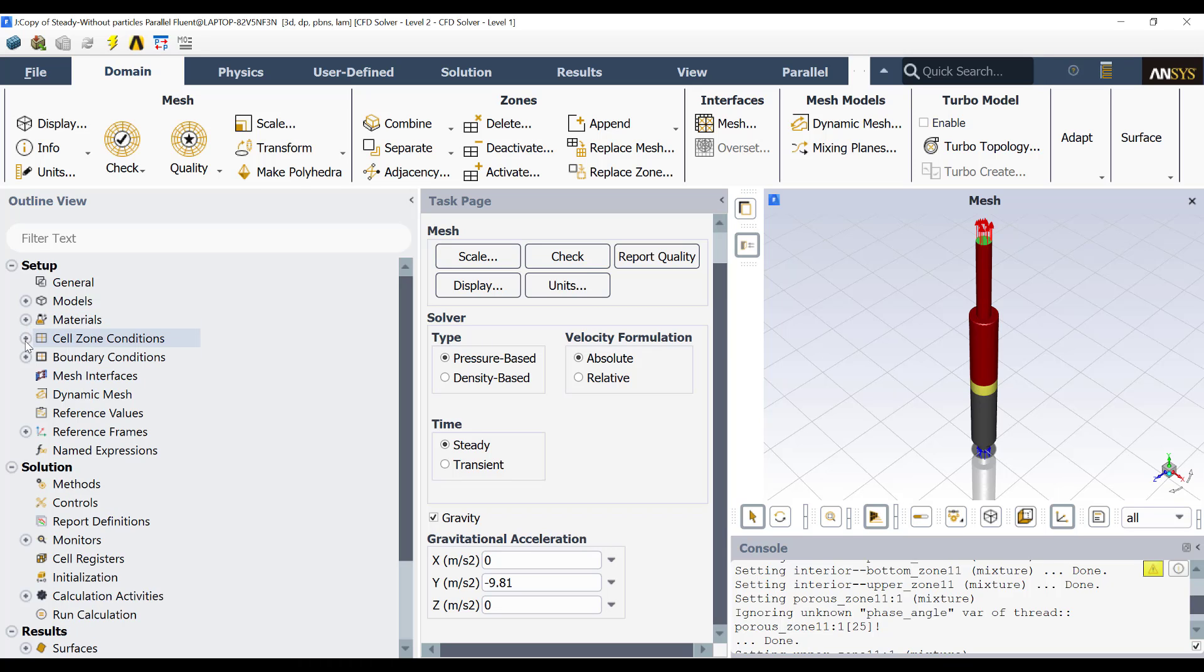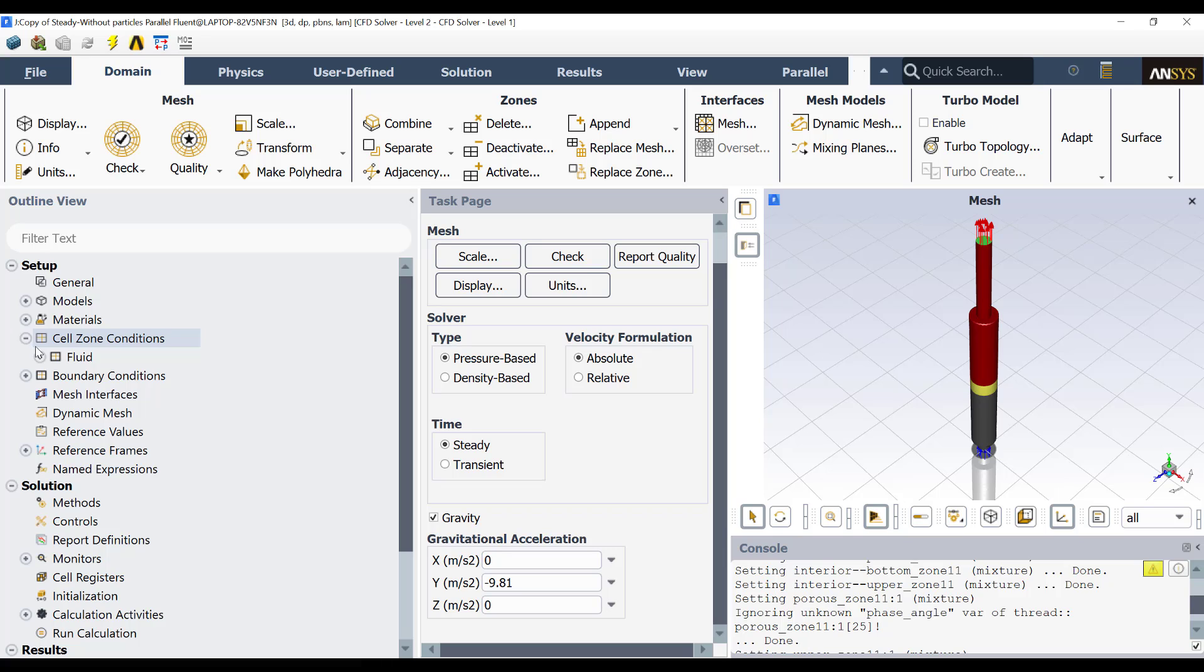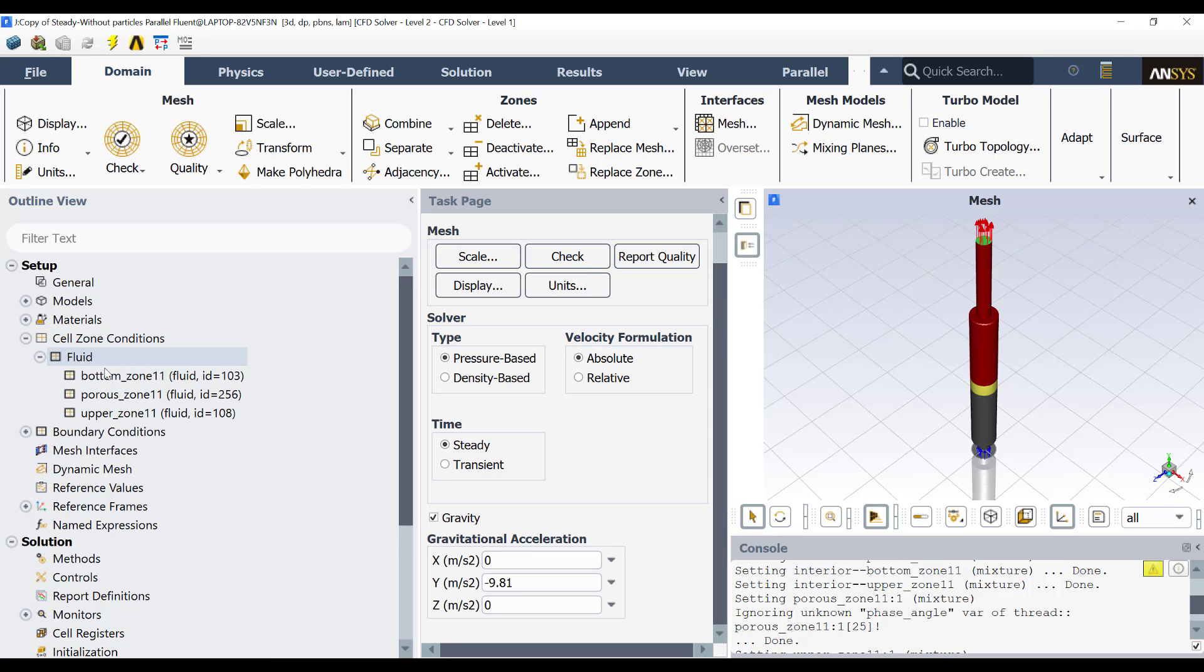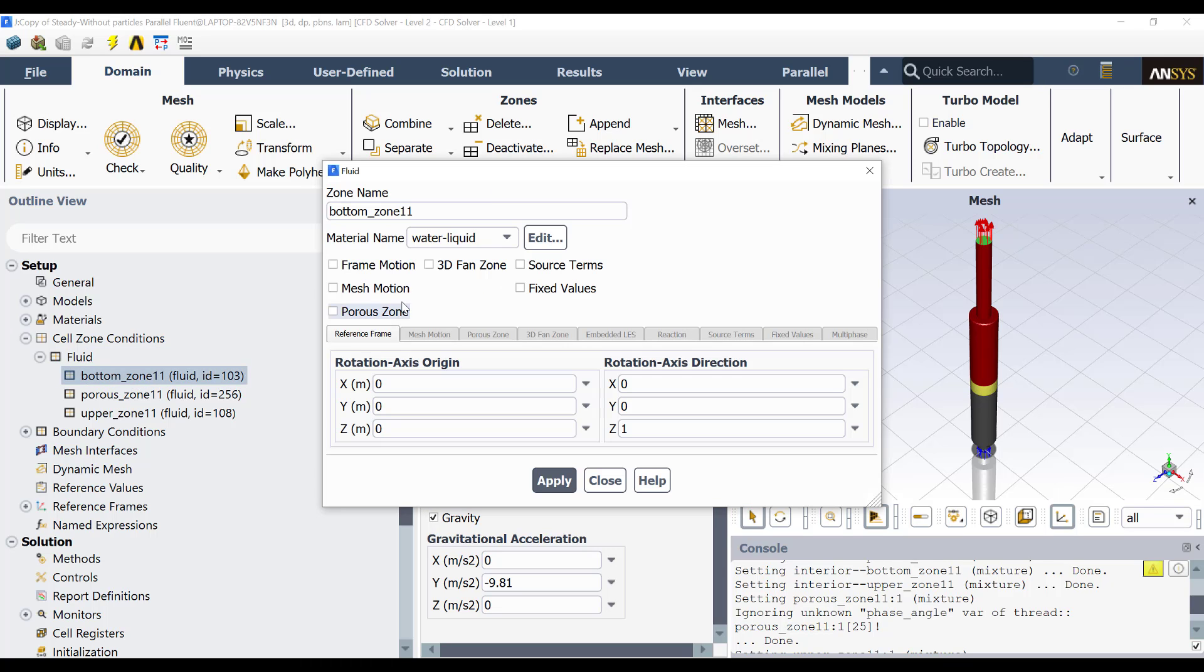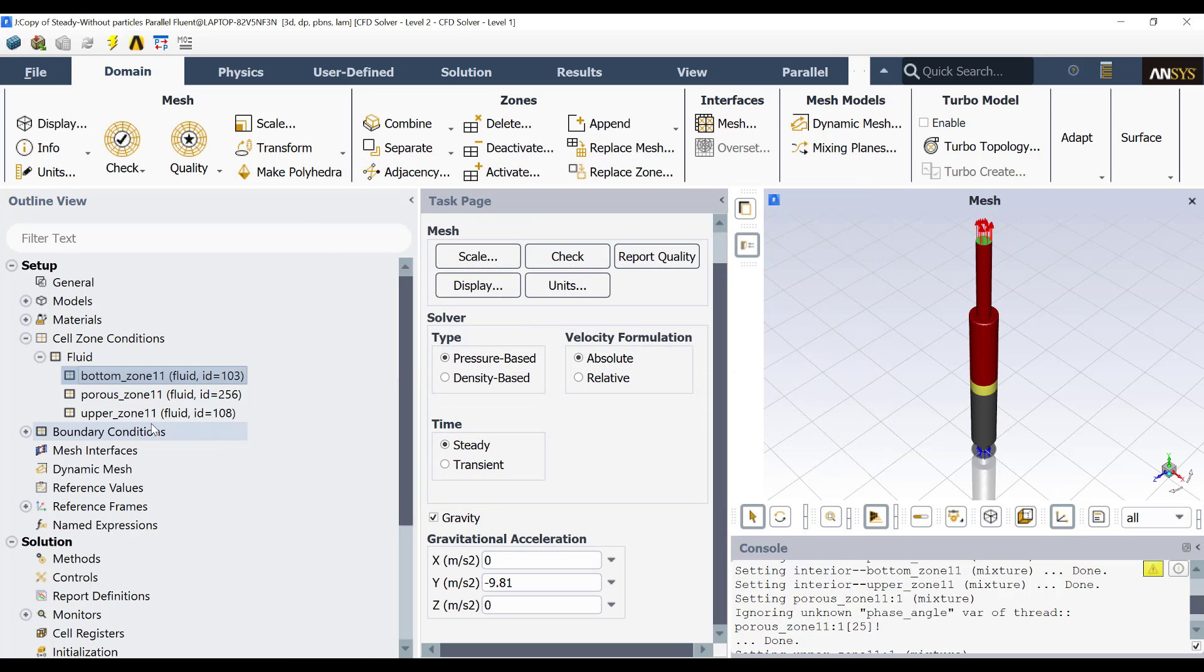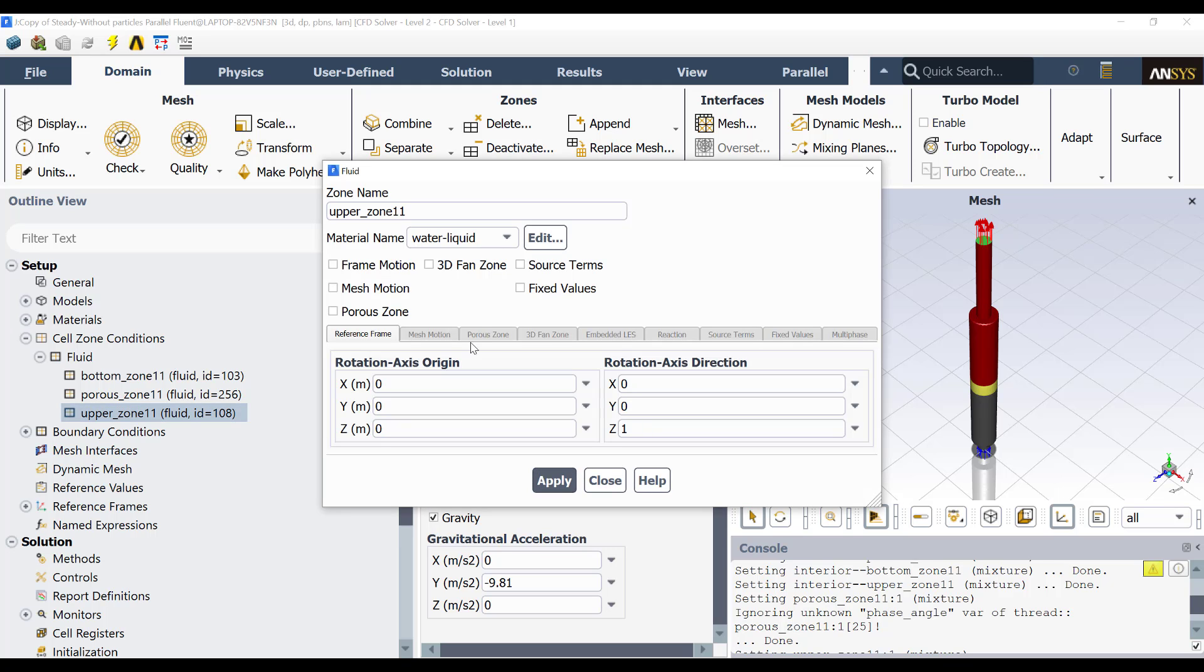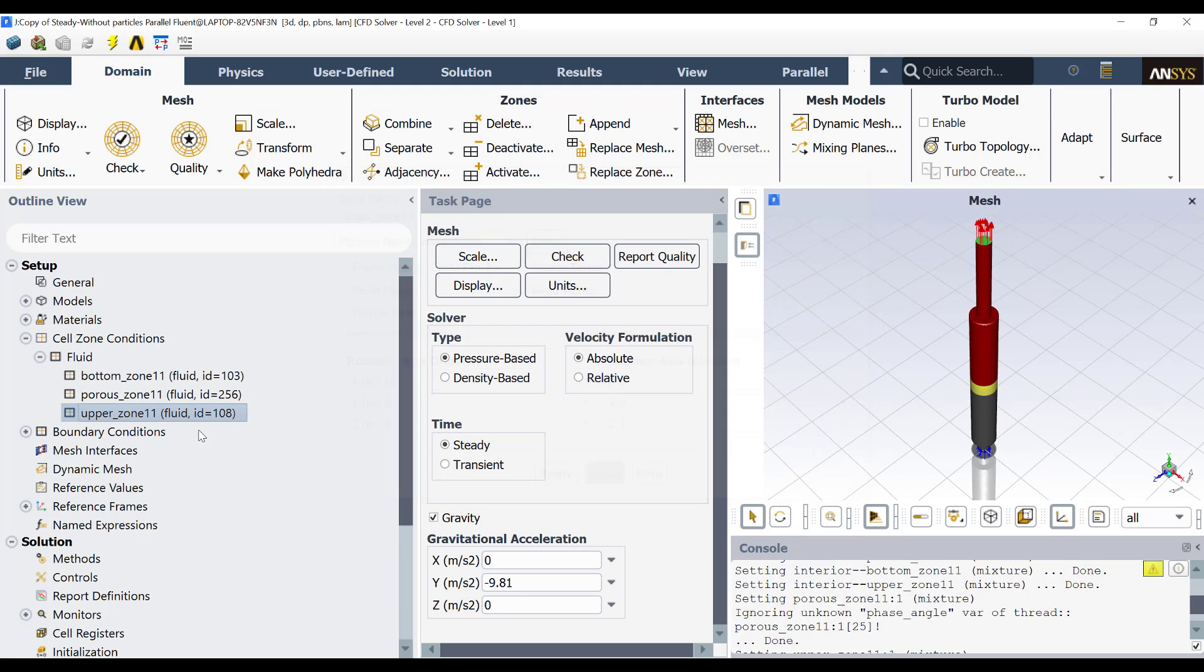And if I go here to Cell Zone, then you will see that I only have fluid cell zones. I have the three zones that I showed you in the geometry in Space Claim. They have the bottom zone, the upper zone, and the porous zone. For example, if I double click here in the bottom zone, you will see that this is water liquid and no more. The same for the upper zone.